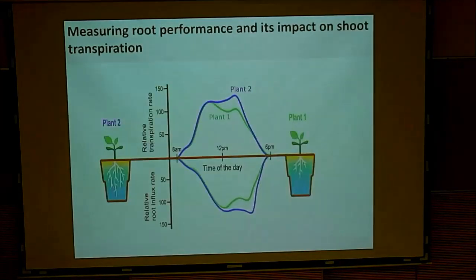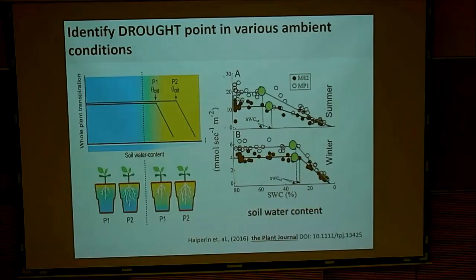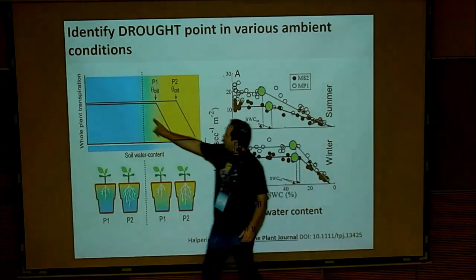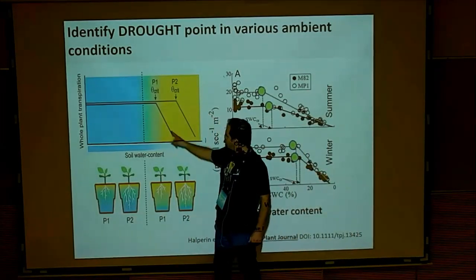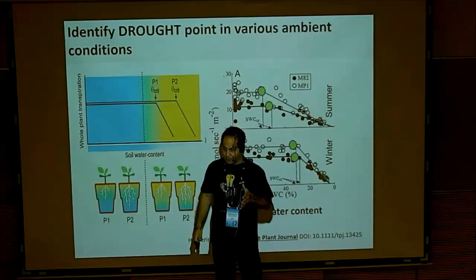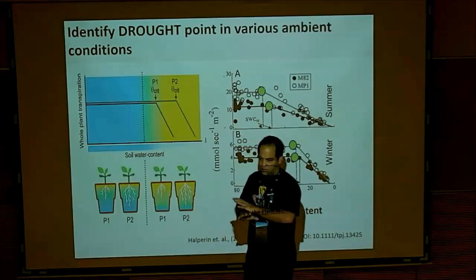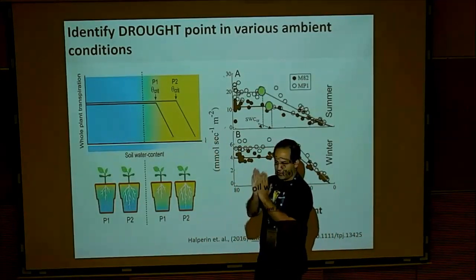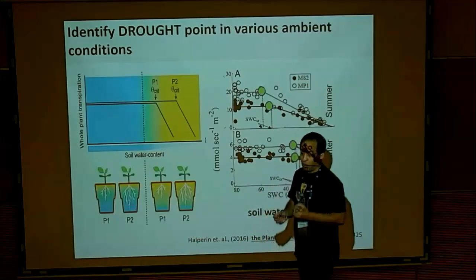Another root function that we do, please. If you have a planted treatment where you are waiting for RNA extraction, we sample here, here, here, usually also here, and at the recovery. We just published a Tree Physiology paper on pines. Usually we just get a mess of RNA, and after we do this, we get very clear and nice results. If you want, I can send you the paper, on pine trees.